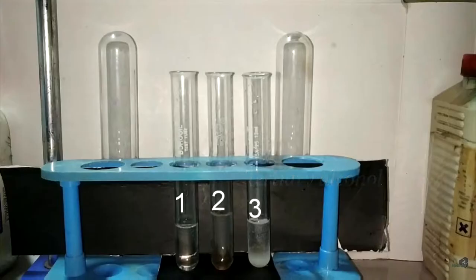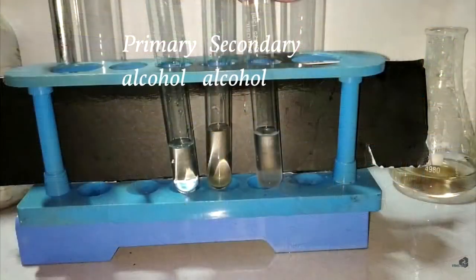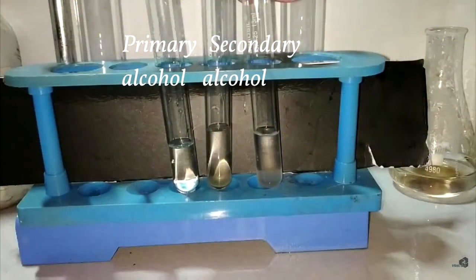Lucas reagent. Secondary alcohols will react slowly, usually in 5 to 10 minutes. Primary alcohols will not react much at all since primary carbocations are so unstable. Therefore, tertiary alcohols react immediately.